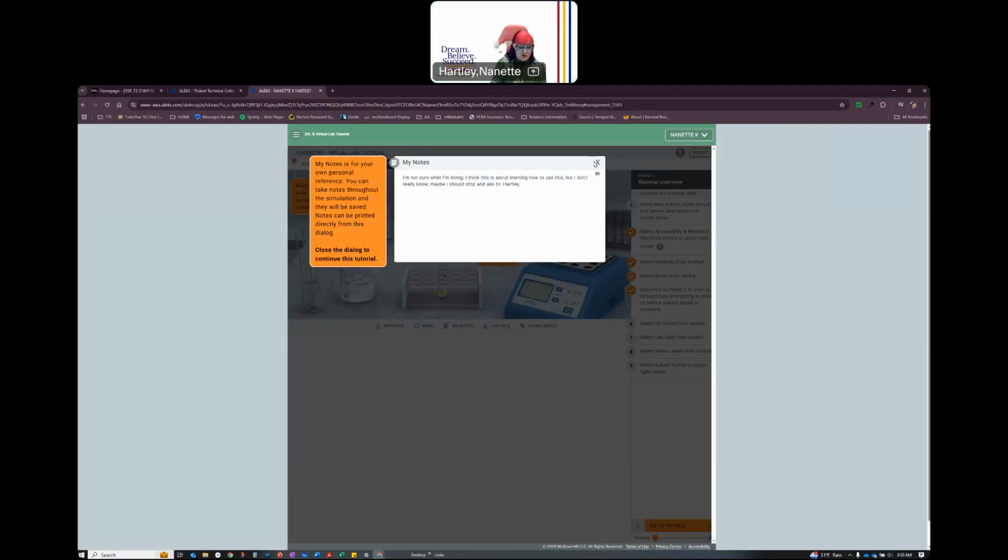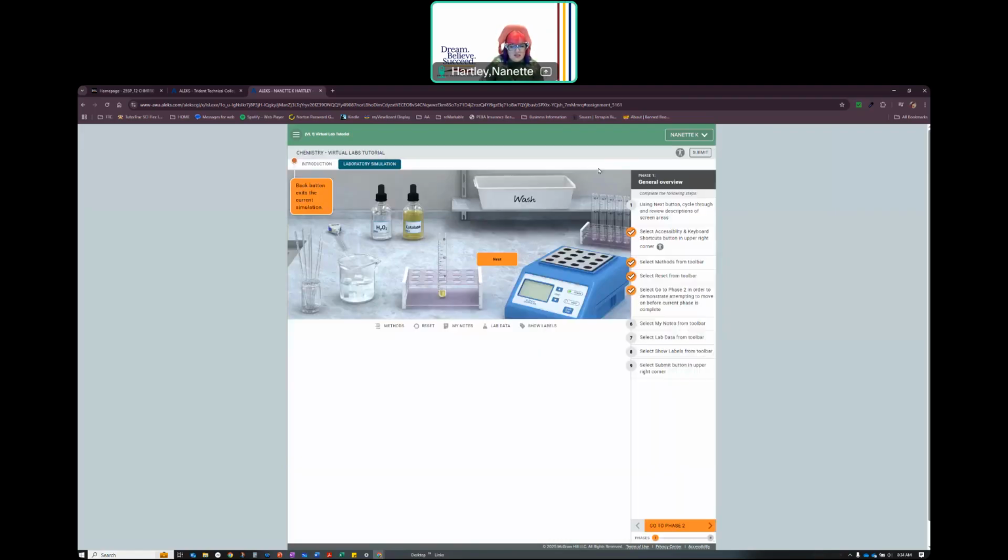Sorry. So the lab notebook is where I'm taking down information that I want to store related to the experiment, a place for me to write down stuff where I'm confused. I don't know what's going on. I'm making notes about what I do and don't understand, what might be happening, that kind of thing. Okay. So that's different than when we talk about lab data.